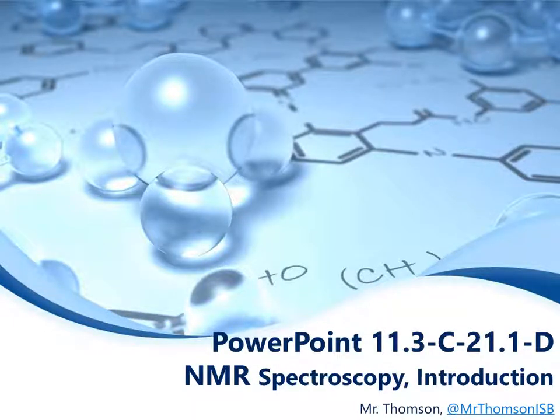Welcome to Spectroscopy video number 4. The focus today will be on NMR, Nuclear Magnetic Resonance Spectroscopy, which is one of my favorite forms of spectroscopy.